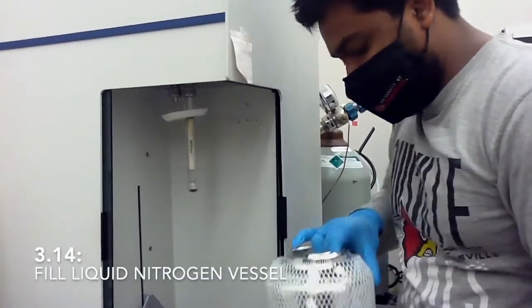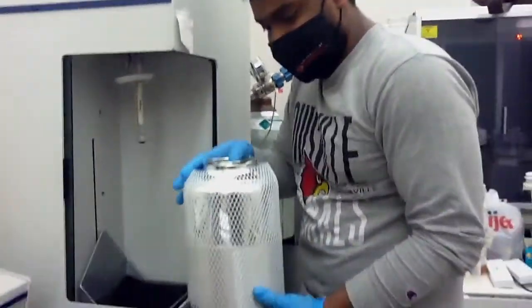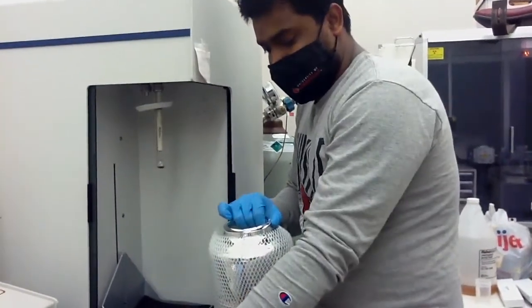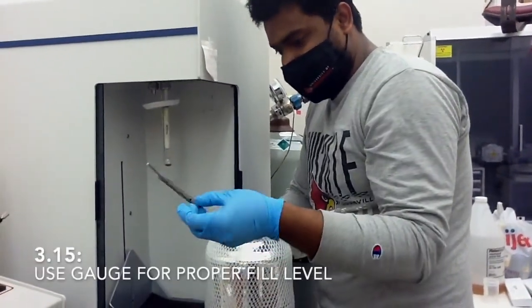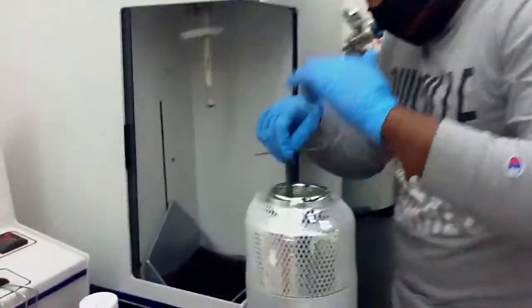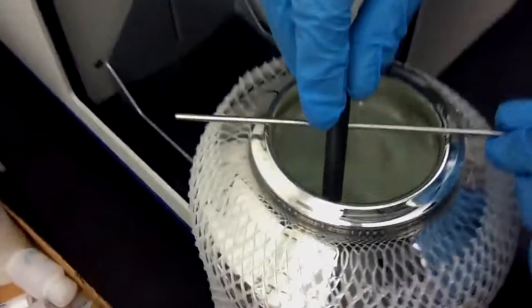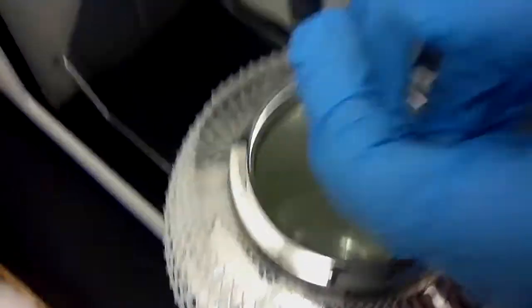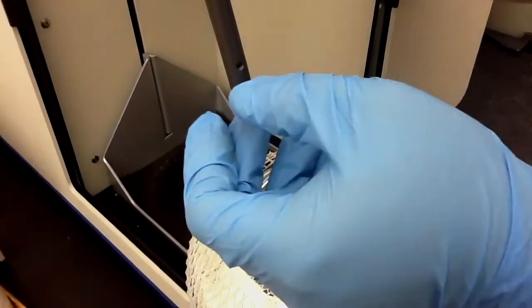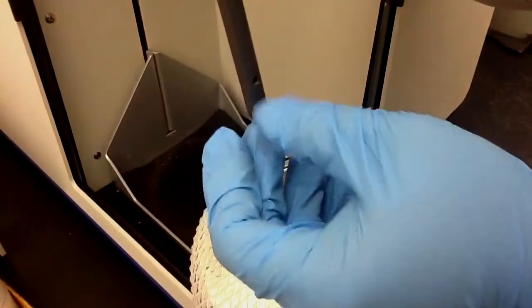you need to fill this bucket with liquid nitrogen. So we have a liquid nitrogen tank over there. So the rule to fill the liquid nitrogen is, this is the meter stick. After putting the liquid nitrogen inside here, you can measure the nitrogen level. So the level should be between this hole and the bottom. So any point is fine.